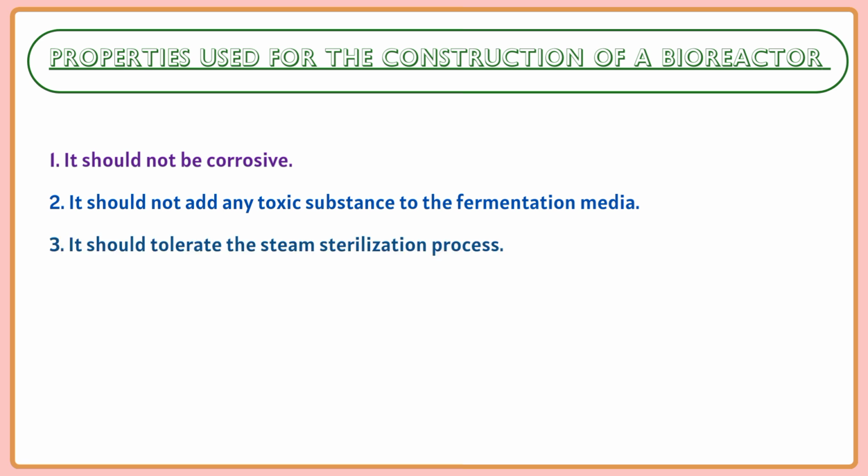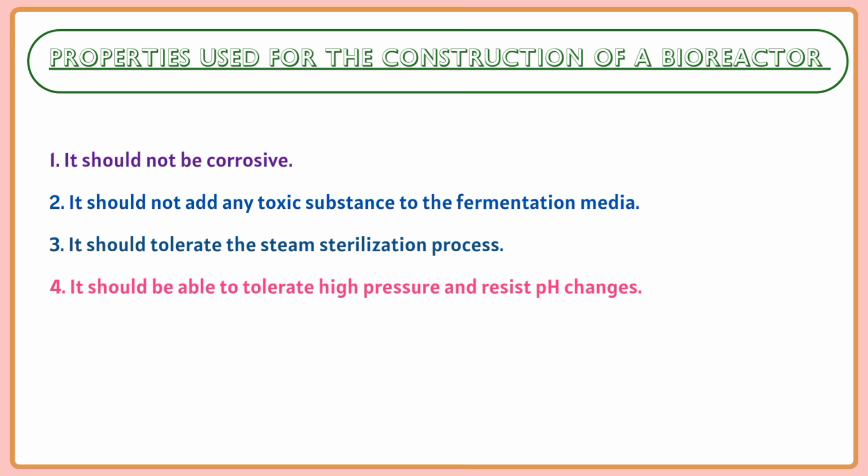Third, it should tolerate the steam sterilization process. Fourth, it should be able to tolerate high pressure and resist pH changes. Fifth, the size of the bioreactor widely depends on the application. That means whatever the application is, we design the bioreactor according to the application.